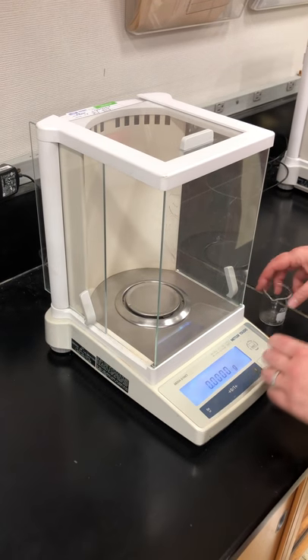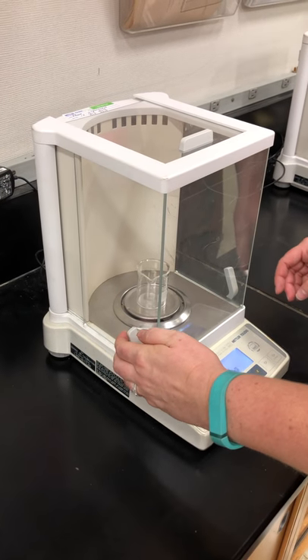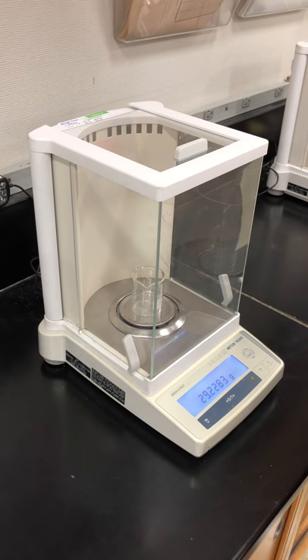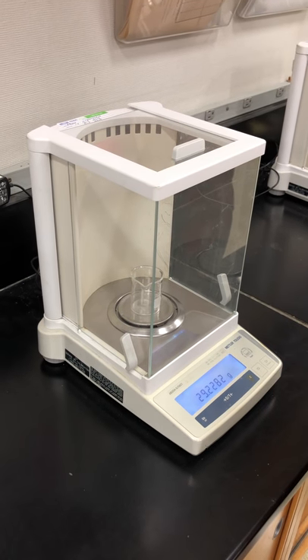To weigh your object, open one of the side doors, put your object onto the balance pan, close the side doors, make sure that you're not leaning on the counter, and then wait for the numbers to stabilize.